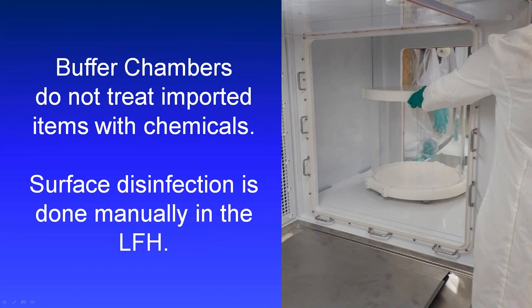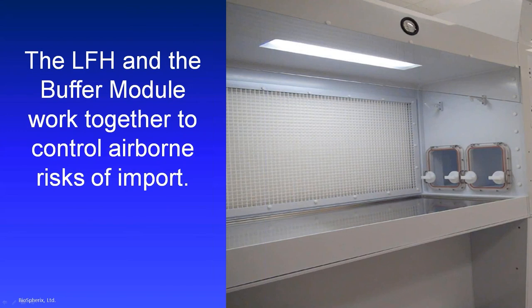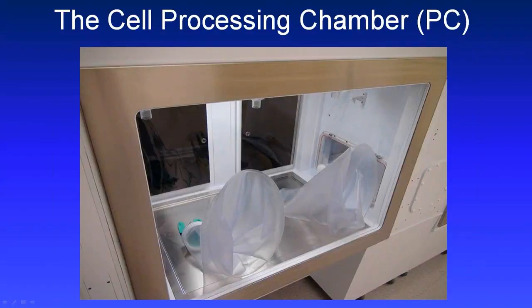Now, buffer chambers do not treat items that you're importing with chemicals the way that some traditional isolators do. Items are disinfected manually in the laminar flow hood before they're brought into the system, and we'll show this as part of the training later on. So this is how the laminar flow hood and the buffer module work together to control airborne risks to your process during import of materials and export.